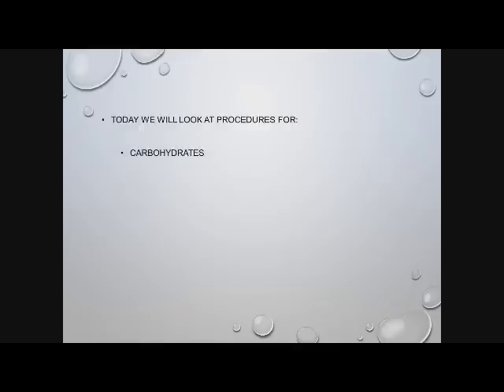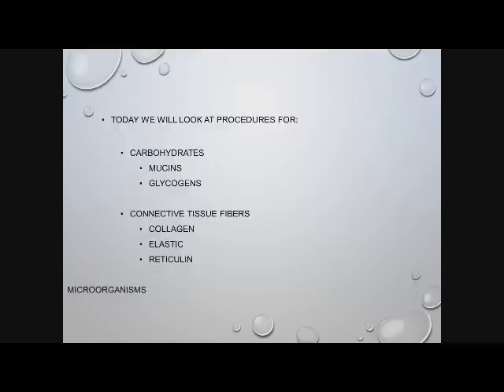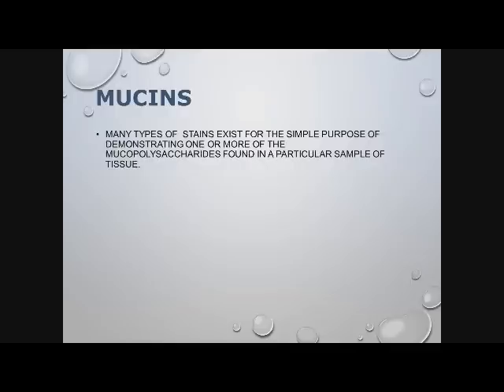Today we're going to look at procedures for carbohydrates, which include mucins, glycogens, and connective tissue fibers, which include collagen, elastic fibers, and reticulin fibers. We're also going to look at some microorganisms to include bacteria and fungus. We're going to start with mucin.